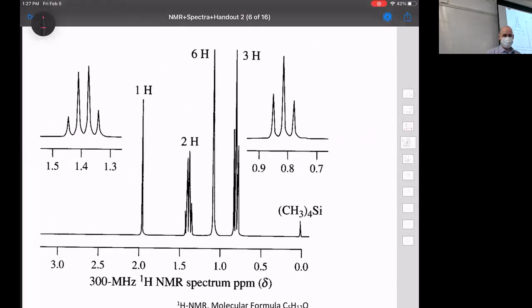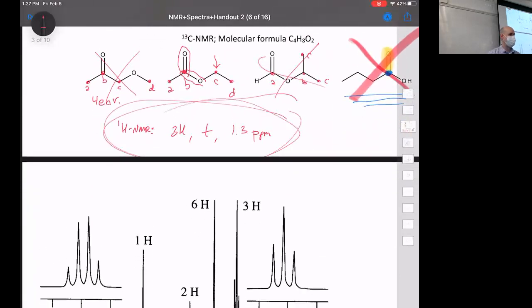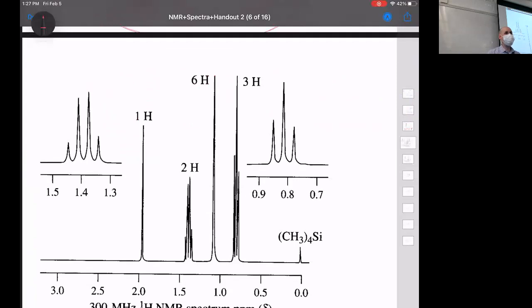And this is 4 different environments. And so for each one of these, you do this thing. You're going to interpret that signal and tell me what it means about that environment. The difference is, and the new skill set is you need to do that for each of the peaks and then put those puzzle pieces together to make the puzzle, right? I would assume that at some point in their life, everybody in here has done jigsaw puzzles, right? Or some type of puzzles.